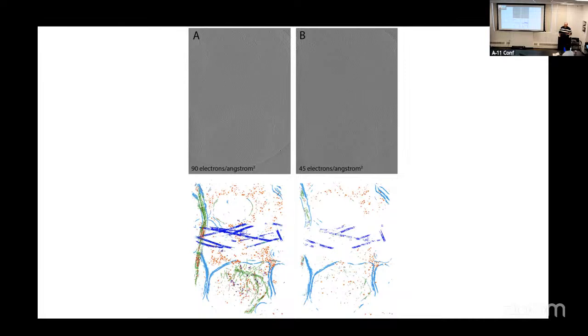Now, how easy is it to distinguish actin monomers in a cell from some other thing? I think that's where it gets really tricky. But in an in vitro situation where you wanted to maybe get some sense of how many monomers were floating around in your buffer, actually, I think it can do it. And we'll see that maybe this afternoon. Any other questions? I should have said, this is a workshop, so feel free to chime in anytime.